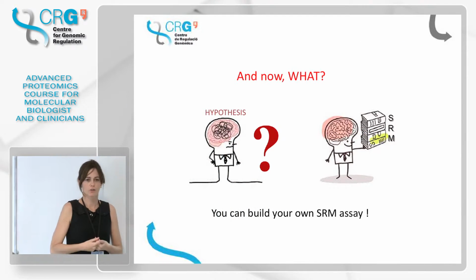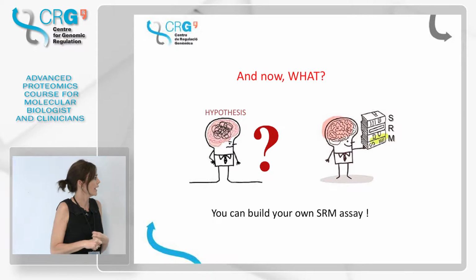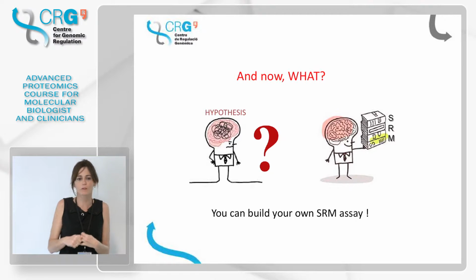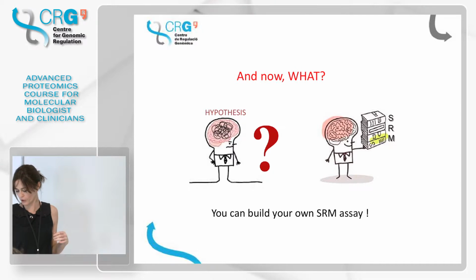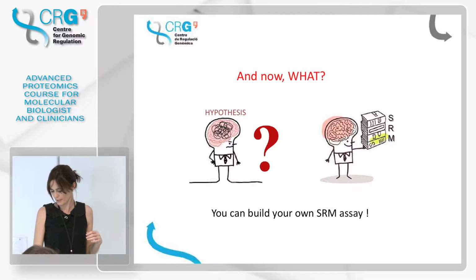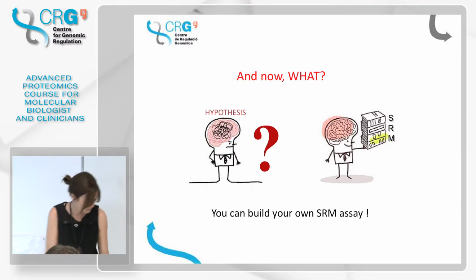Okay, so now you know everything. You have your hypothesis, and you know what SRM is. Now what? Now you want to apply it to your project, okay? You want to build your own SRM assay.